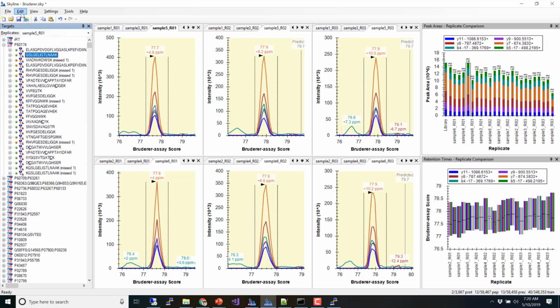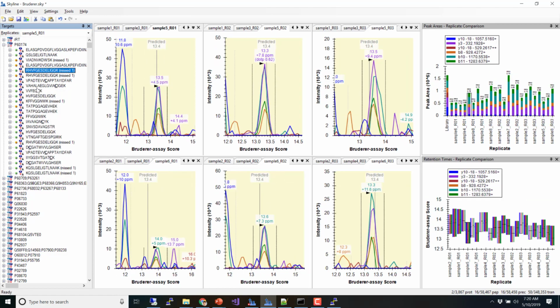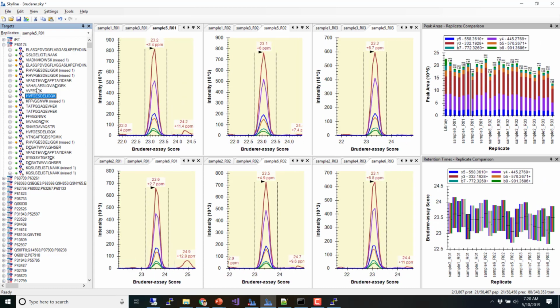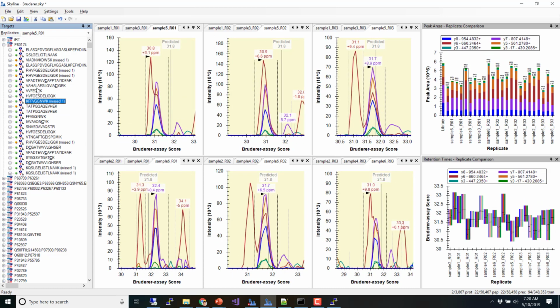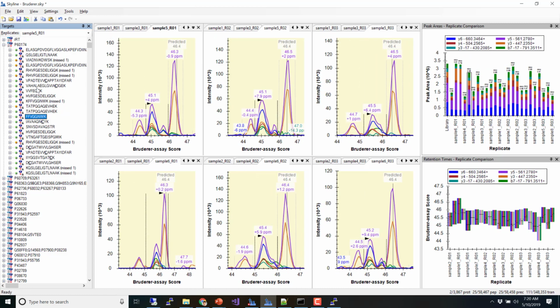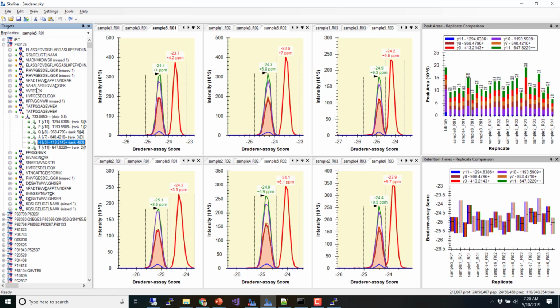Wow, we looked at the iRTs in one protein, and we actually learned quite a bit, right? One thing I do want to bring up is one advantageous thing about interferences and the fact that they are from other peptides. I deleted it, didn't I? If I undo my deletion, okay, so I'm looking at this.